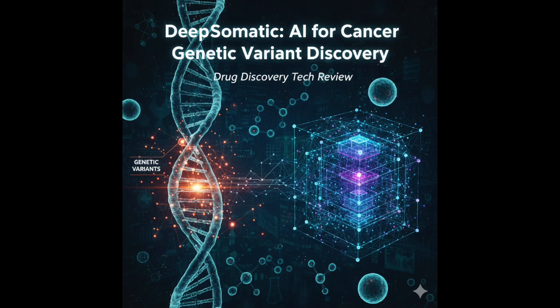And the standout was really that indel performance. Let's put some numbers on that comparison again. Yeah, the indel leap was remarkable. For standard Illumina WGS data, DeepSomatic hit F1 scores around 90% for indels. The next best tool was hovering around 80%. A solid jump. Okay, 80 to 90%.